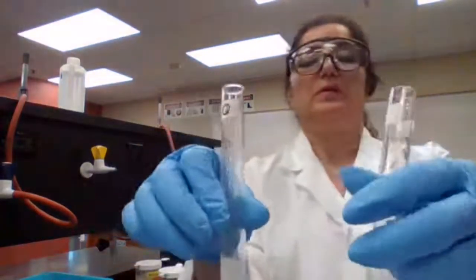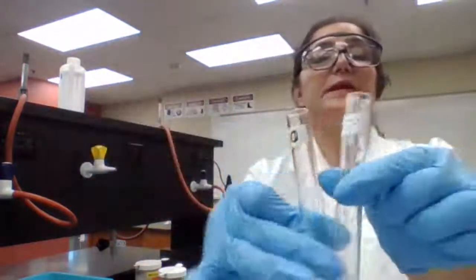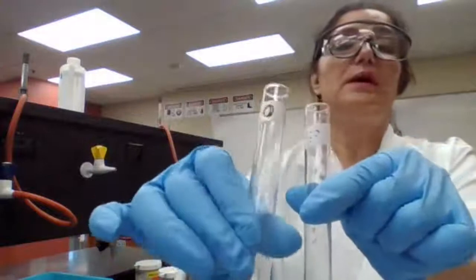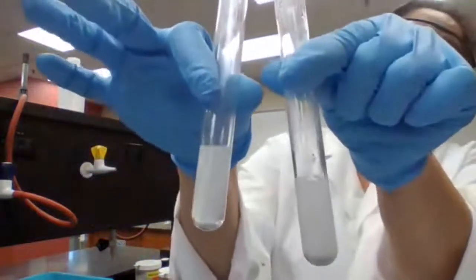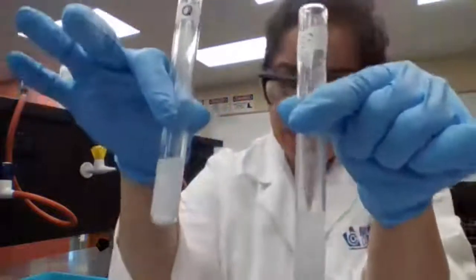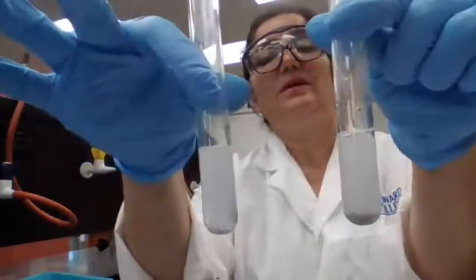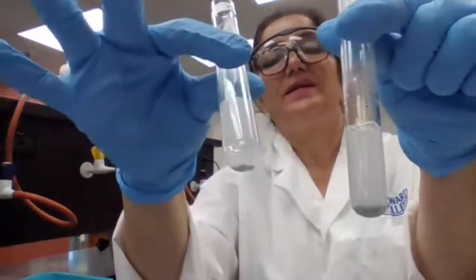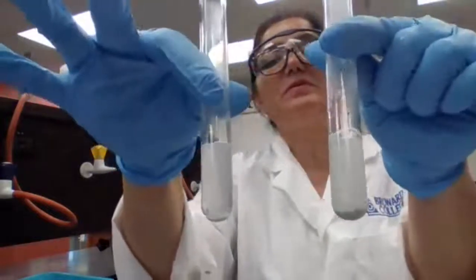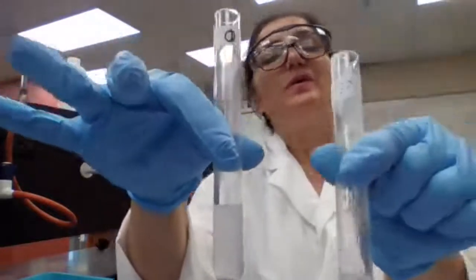So compare the rate. And here is the indication. You see the granule and then the shot. The more bubbles forming or faster formation of the bubbles is a faster reaction. So it's more of a qualitative analysis. We still have zinc in both of them, but the reaction for the granule is much faster.